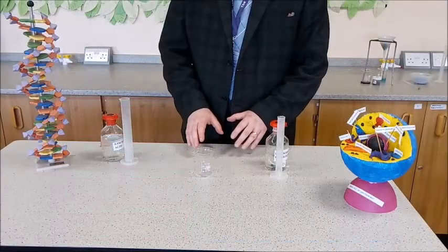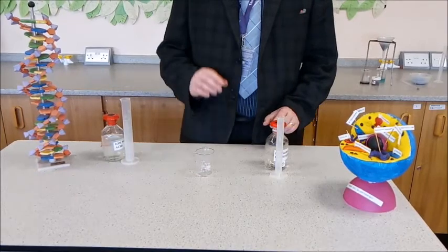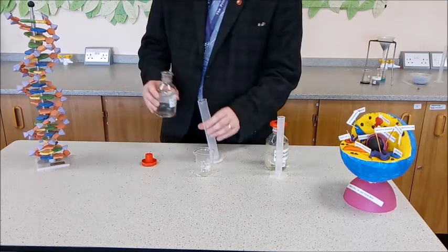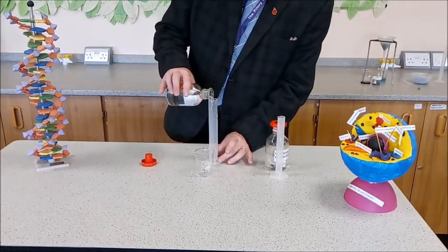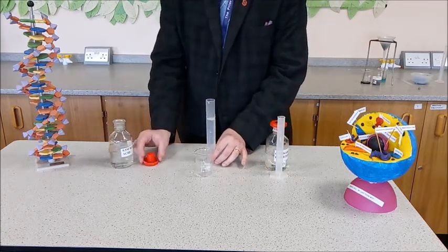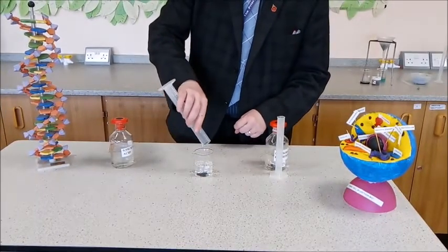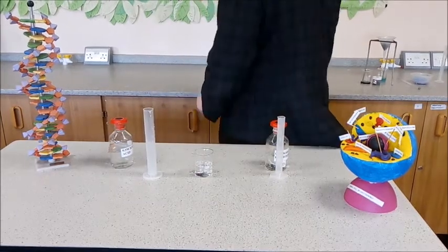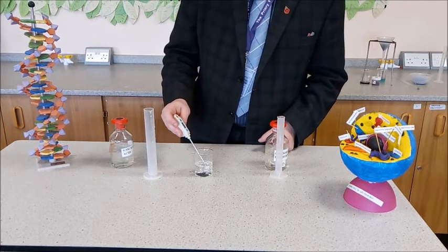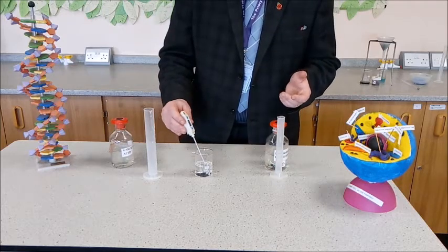In this short bit of video, we're going to look at how we can look at temperature changes within the experiment. We'll start off by measuring out 50 millilitres of sulfuric acid using a measuring cylinder. We then pour that in. Next, you would take an initial temperature, which would be 18.3, because we want to see what the temperature change is going to be.